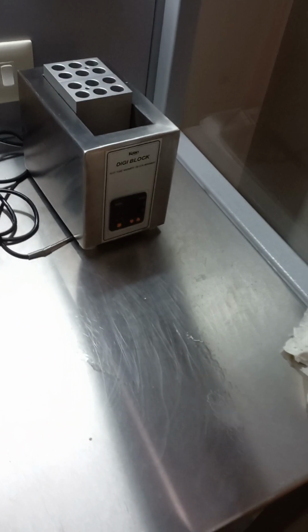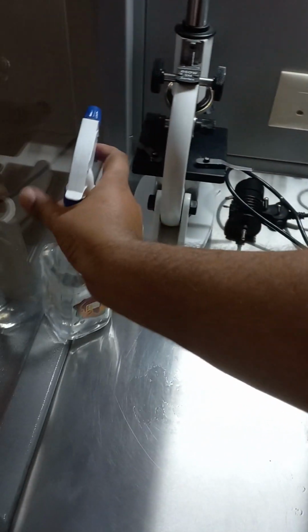The only thing we do is we do it one day prior, so that any bad chemical, the smell or the VOCs escape by the time we end up doing the actual procedure. So this is late at night today that we are doing this cleanup. In my case, since I do everything on my own, otherwise I don't get a good night's sleep, I am doing the cleaning process also on my own. This makes sure that all the surfaces are cleaned 3-4 times.